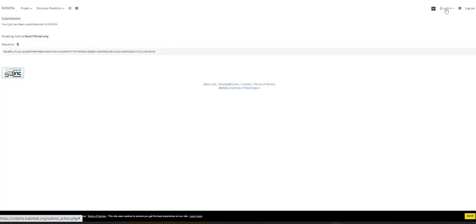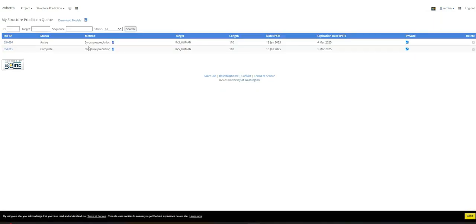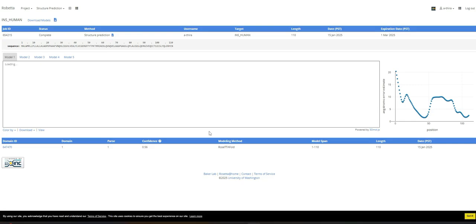To access our results, we can click here on your username, and you can click this My Queue option. Then you can view your status page, your results page. And if we click on this job ID, you can view your models and these results.